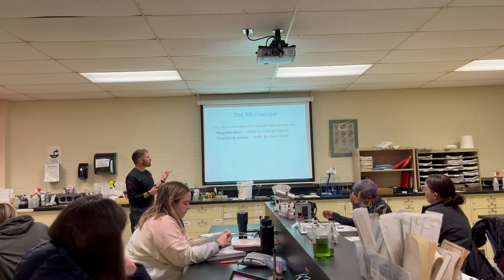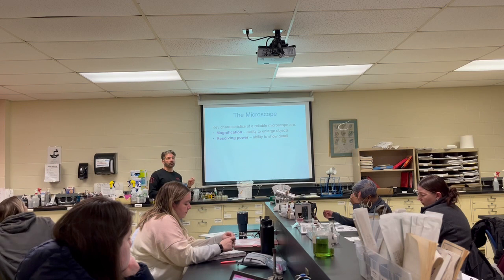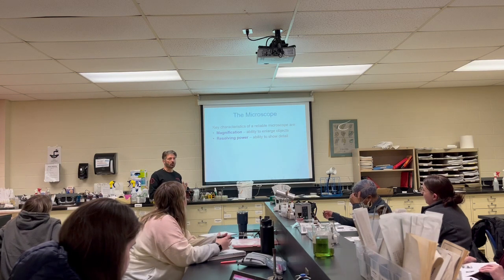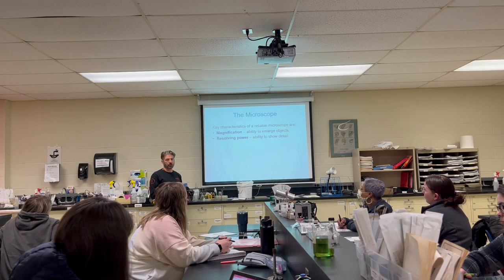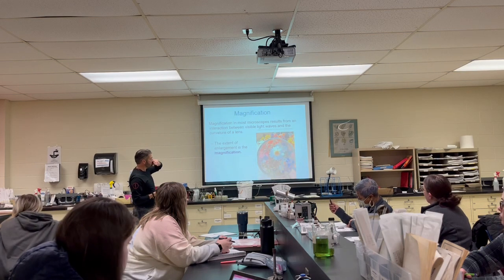And resolving power is the ability to show detail. We can magnify something all we want, but if we can't resolve it, it doesn't do us any good. Everyone here has had an eye exam before? So what do they have you read? That Snellen chart, and they check out your resolving power. Very similar to that.